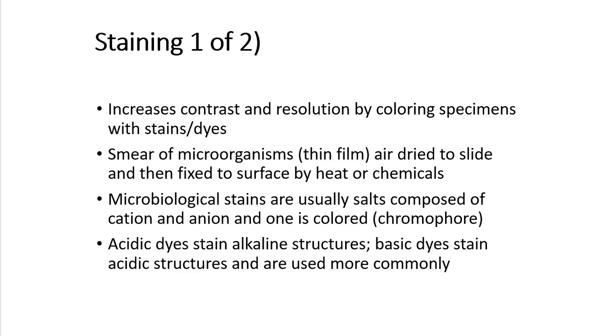Now, we're going to briefly go into stains, because in order to do microscopy in bacteria, you got to stain. And we're going to go through stains in detail in the labs. But it allows us to increase the contrast and the resolution by coloring these specimens. Okay?